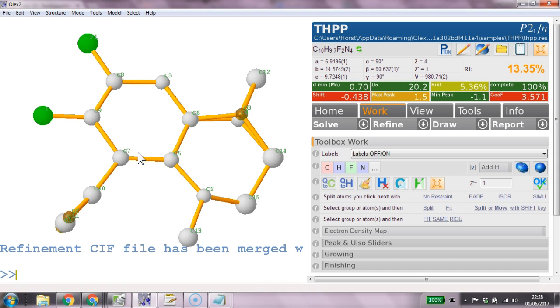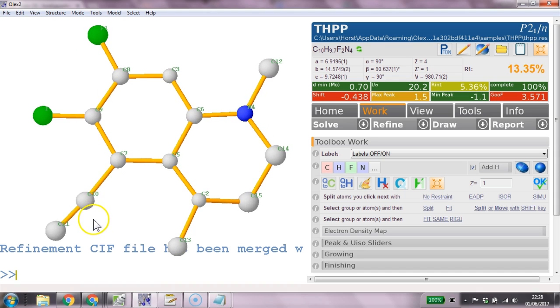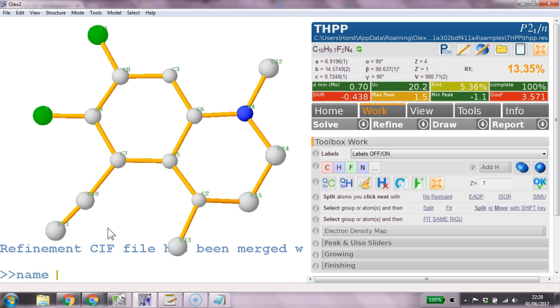And I think it's quite clear if I hide those Q peaks again where the peaks are so C4 is the up key name C4 that is a nitrogen nitrogen and C now what's this one I can't read this one for the mouse we need the mouse C11 name C11 nitrogen I think C3 looks like one name C3N and C2.